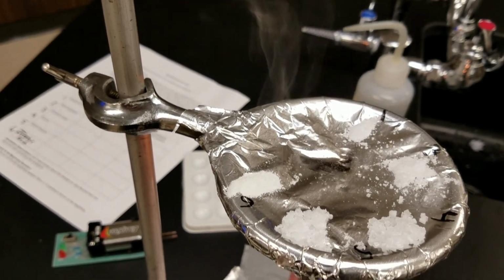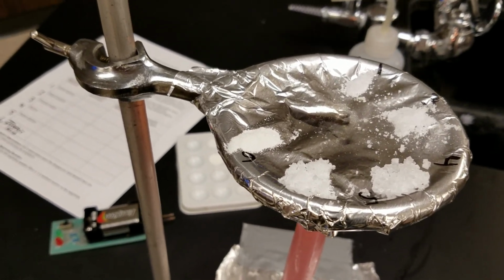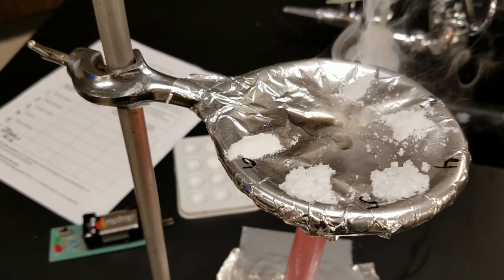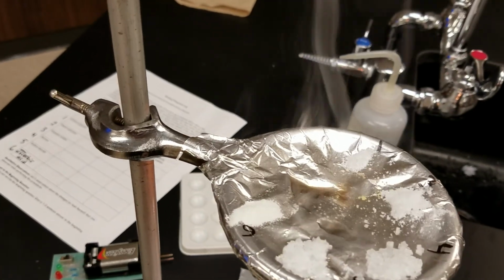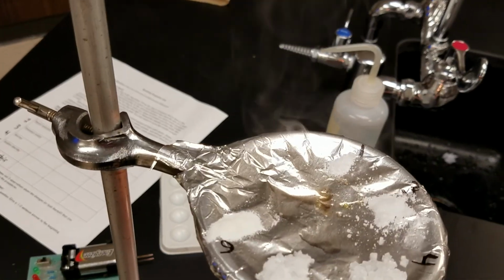That phenyl salicylate is still evaporating. It must have a very low melting point and a very low boiling point. So calcium chloride hasn't done anything.